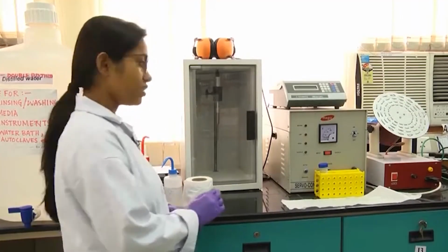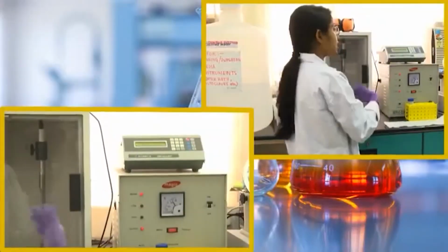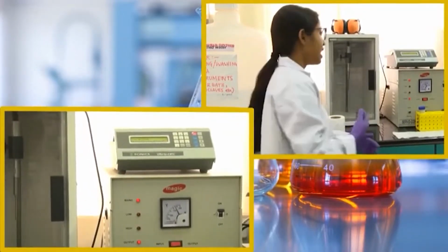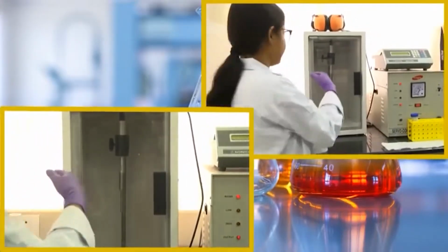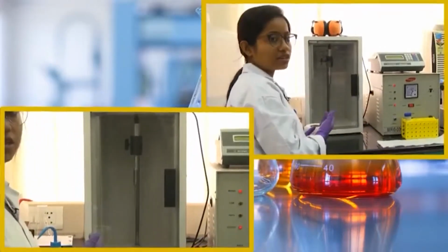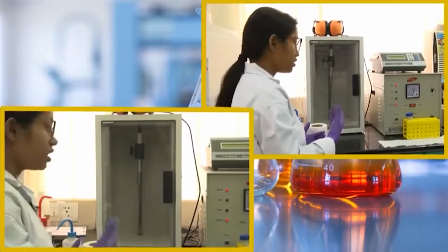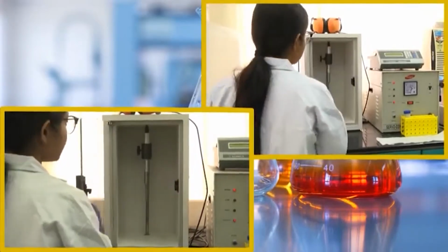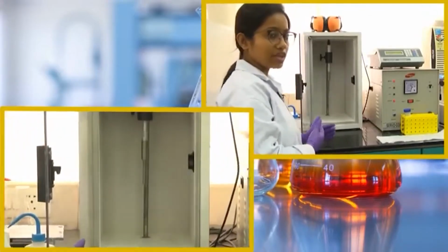In a particular sonicator machine, you have a control system where you can choose the pulses and the amplitude at which the vibration will occur, as well as a probe. This is basically the soundproof box, because it generates ultrasonic sound, and you should have this in an enclosed soundproof box, otherwise it might create a problem for your own ears. Inside the box there is a metallic probe. You can change this probe based on your sample requirement.